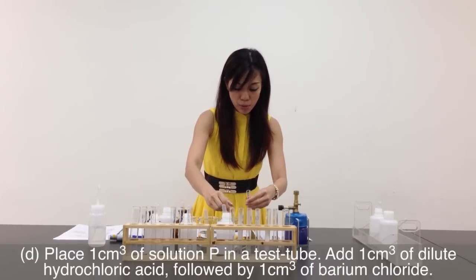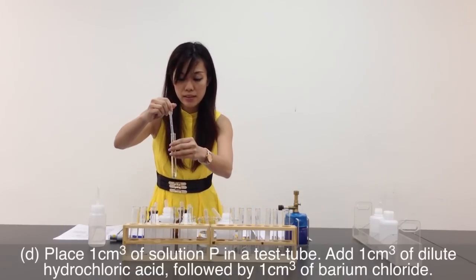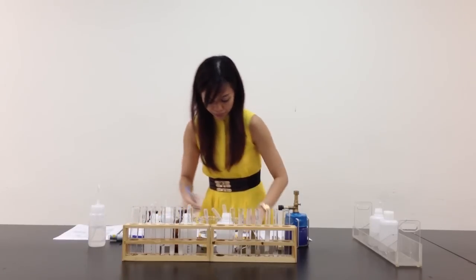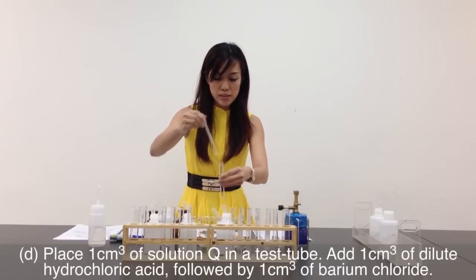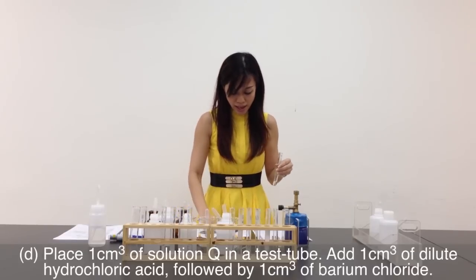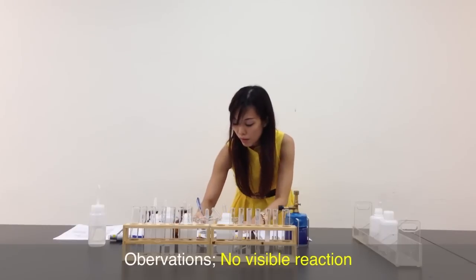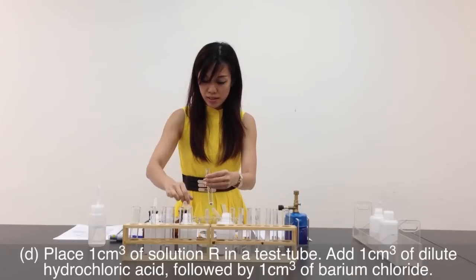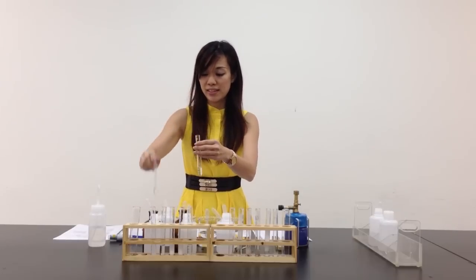Left with the last part — Part D. Place 1 cm³ of P, then 1 cm³ of dilute hydrochloric acid, and then another 1 cm³ of barium chloride. No visible reaction. For Q, same thing — 1 cm³ of Q, 1 cm³ of hydrochloric acid, and another 1 cm³ of barium chloride. Also no visible reaction. Finally, R — 1 cm³ of R, 1 cm³ of hydrochloric acid, followed by another 1 cm³ of barium chloride. No visible reaction.